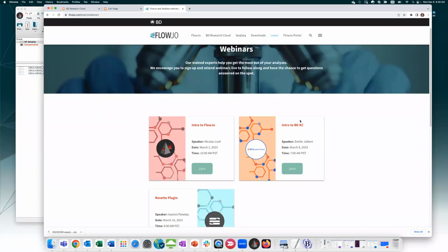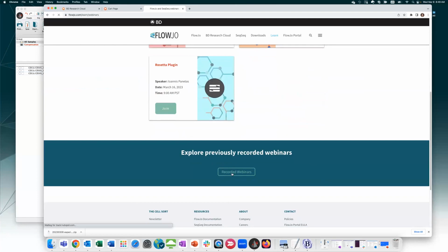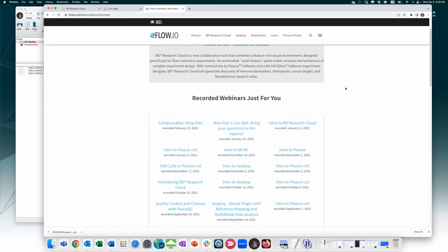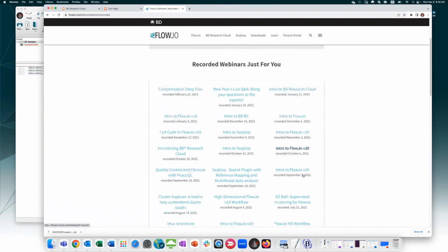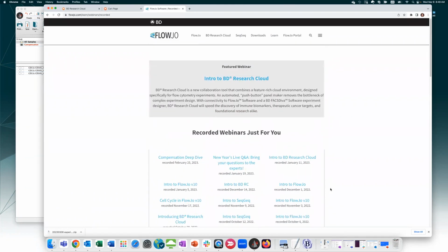Intro to BDRC, where you're at today. So you can sign up for upcoming webinars. If you want to view this one again or any other, you can go to the Explore previously recorded ones. And so you can find Intro to BDRC here, but then you can also find other FlowJo and other related webinars that were given.